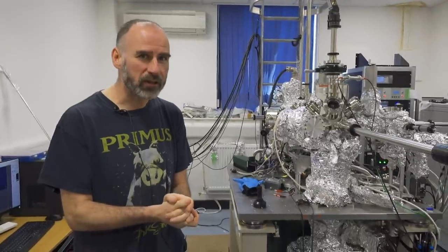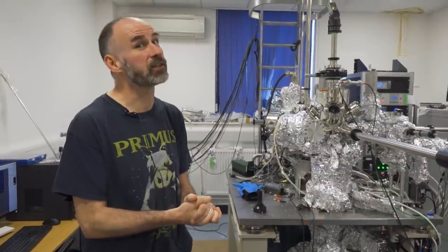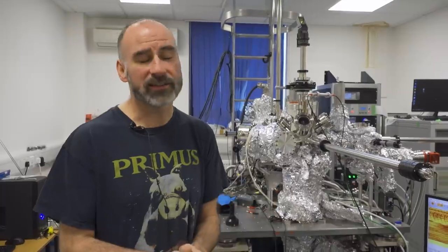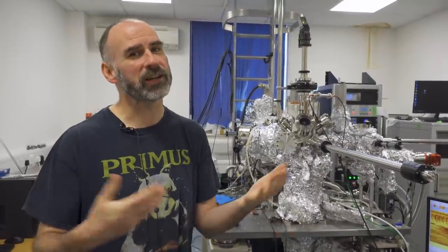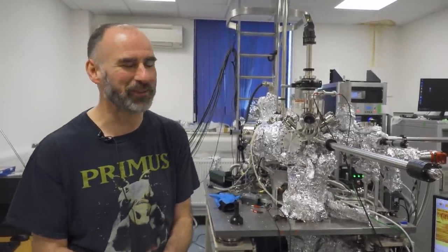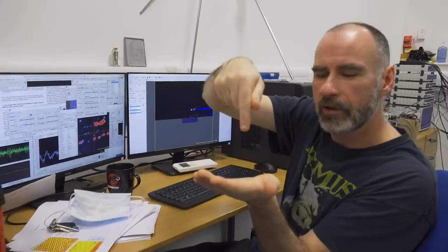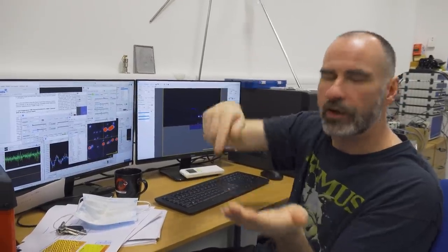Not only does it get down to that temperature, it gets down to that temperature and stays there for 63 hours. What we say is our hold time is 63 hours. That's very helpful for us. It allows us to do prolonged experiments. What we'd really like to do is to take the tip, which is coated with gold atoms because we've deliberately crashed into the surface, and then go dot and drop down an atom, and dot and drop down another atom, and dot. And if we could do that, that would be little short of magical. It would be really neat.